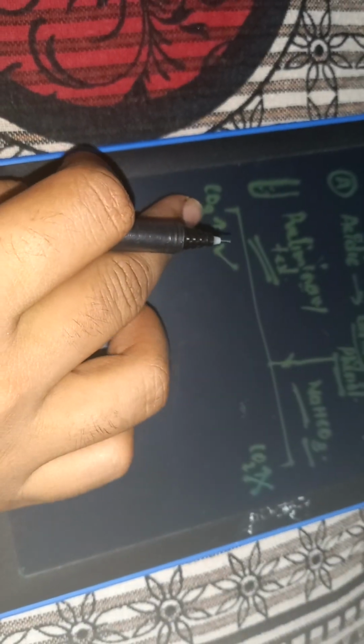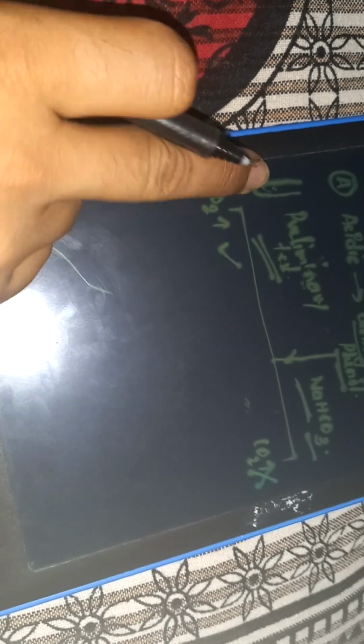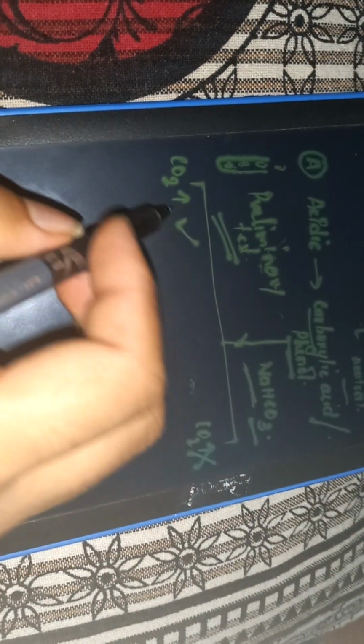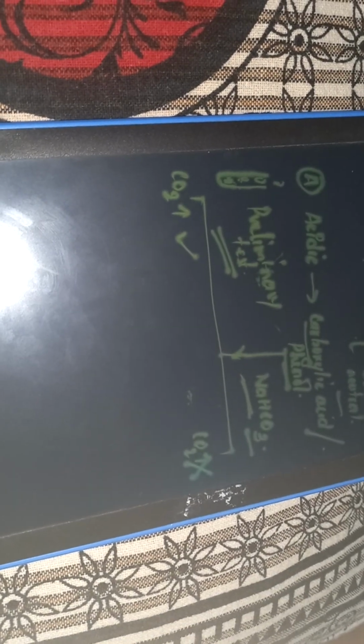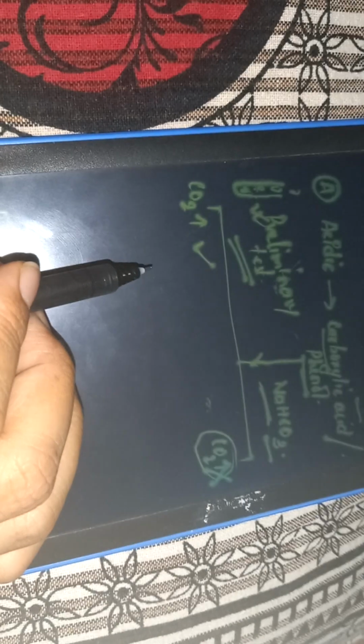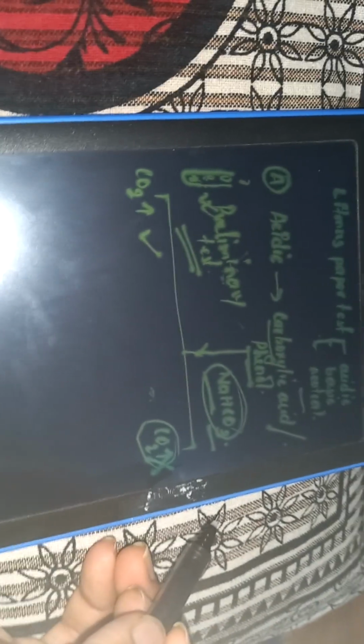If CO2 is evolved in this test tube, you will see bubbles going from the downward direction to the upward direction. But if there is no CO2 formation, you will not see air bubbles. You have to observe very carefully, and the main component is this sodium bicarbonate addition.